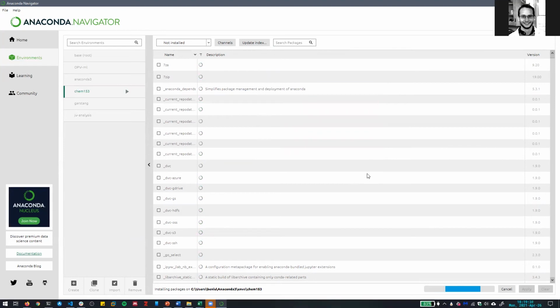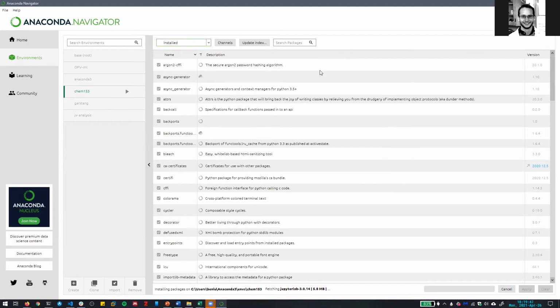All right, so thumbs up. Who's got an environment made and all the packages installed already? Oh, good. Lots of people faster than my computer. Once this finishes installing, then we'll start up an example Jupyter notebook. Yeah, it pops up all these command line things all the time. It's really annoying.